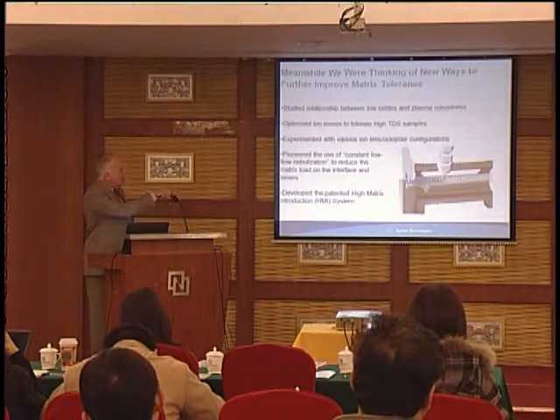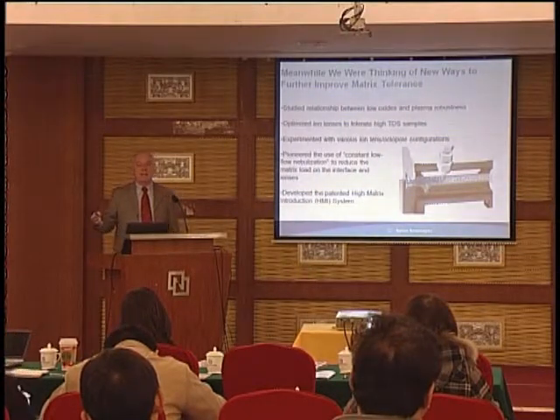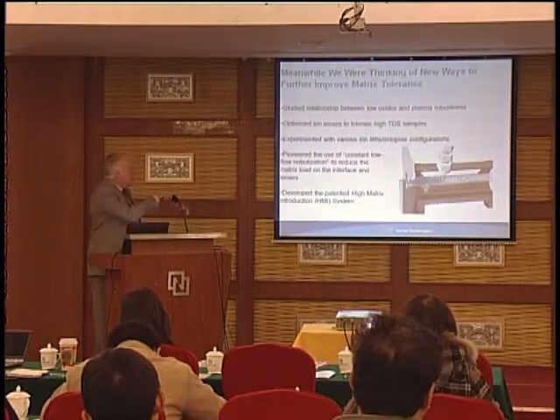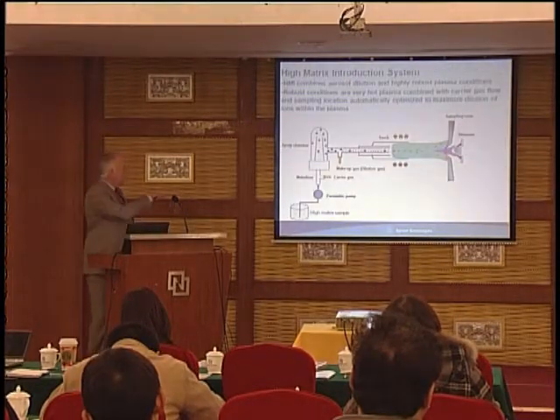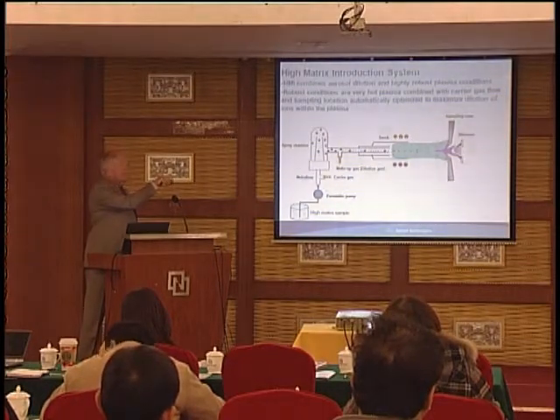And so this is an example. This is showing the transfer tube between the spray chamber and the torch, where we can actually add a dilution gas, dilute the density of the aerosol with a dry argon. So we achieve two things. We dry the plasma, or we dry the aerosol going in, and we also reduce the concentration. And the concept sort of works like this, basically. So we're adding a makeup gas, we decrease the density of the aerosol, we actually increase the sample depth, the depth between the end of the torch and the sampler cone.